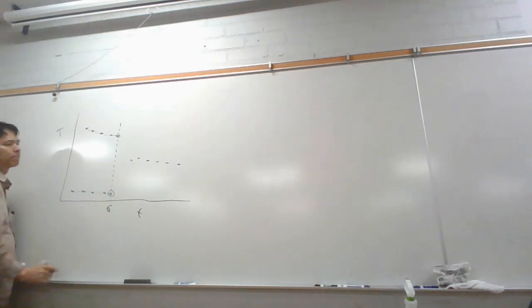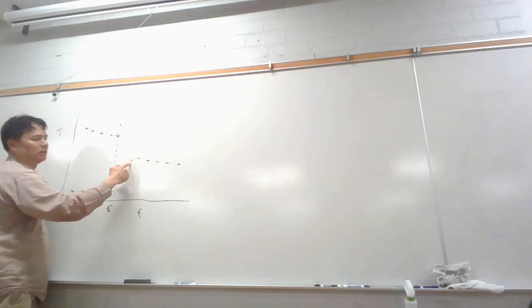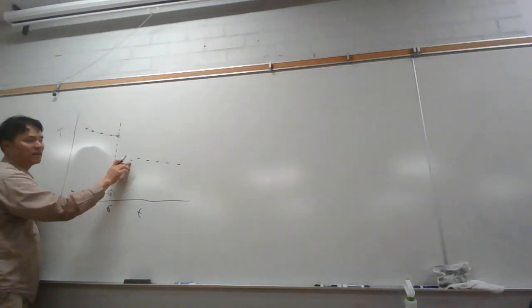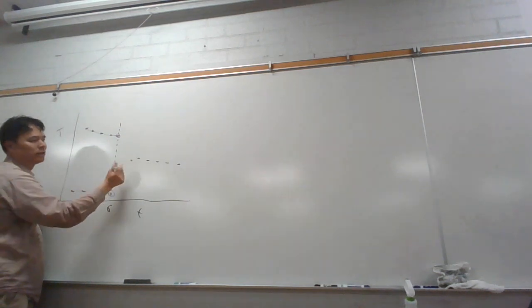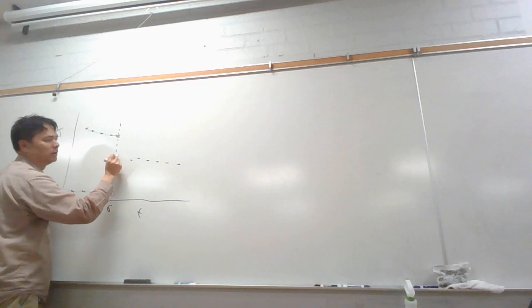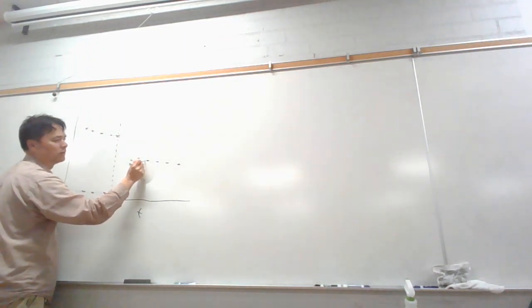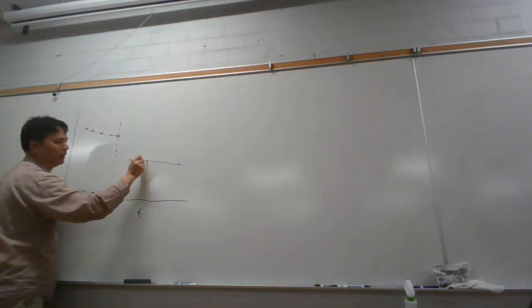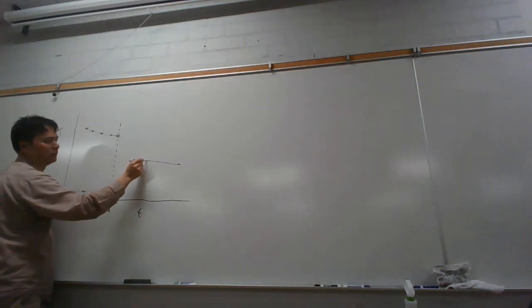Now the mix, if you have warm water, it's not going to heat up naturally. It should be cooling. So this is incomplete mixing. So this is why we ignore the initial points and just focus on the latter points of the graph, because by 8 minutes or longer, it should be well mixed by then.